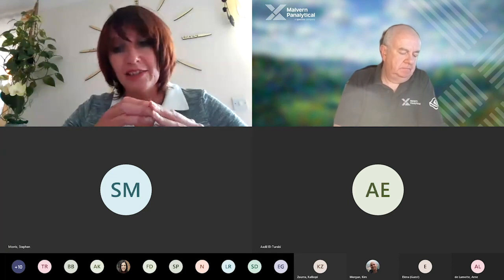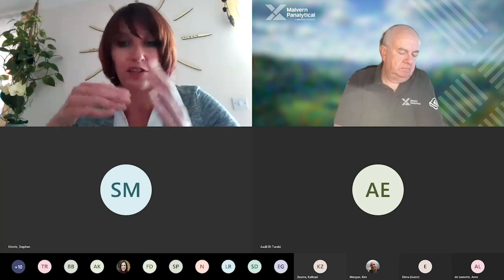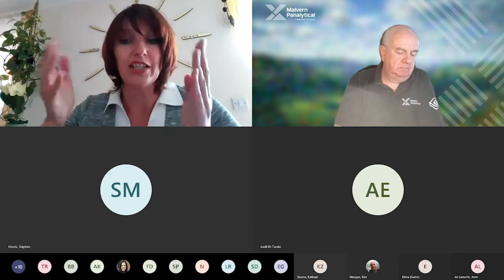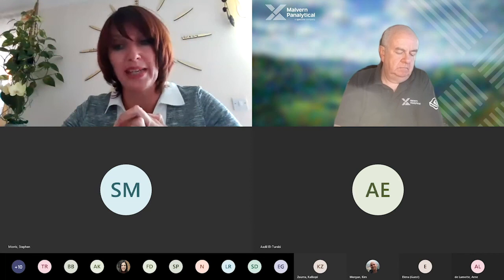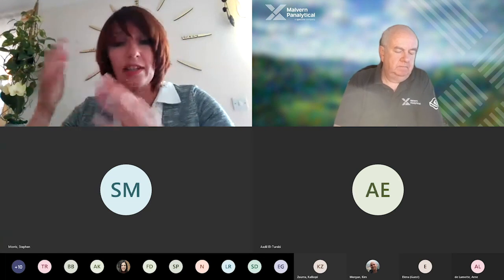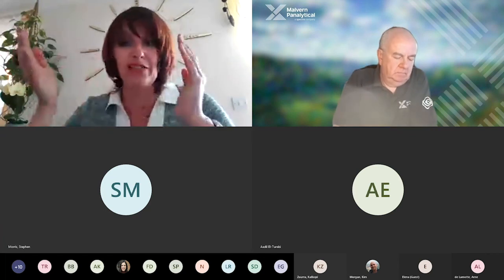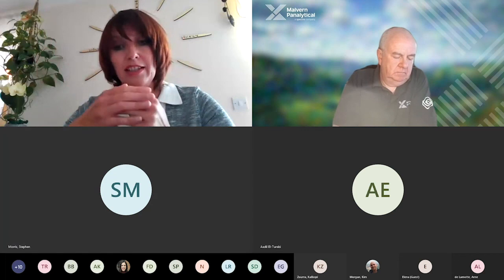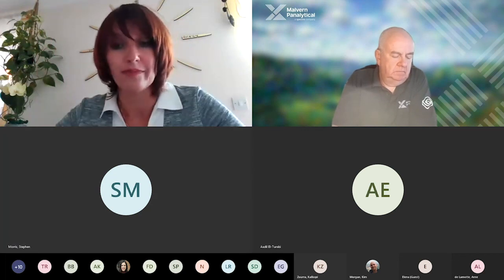If you're looking at high resolution, at understanding what happens after this primary aggregation has been formed, potentially a combination of the two might give you the full picture, because DLS will be much more sensitive to those aggregates, even above 1 micron size, while NTA will give you the picture between 30 nanometers and 1 micron size that might be missed from DLS. So I think after this initial aggregation, the two techniques give really the full picture.